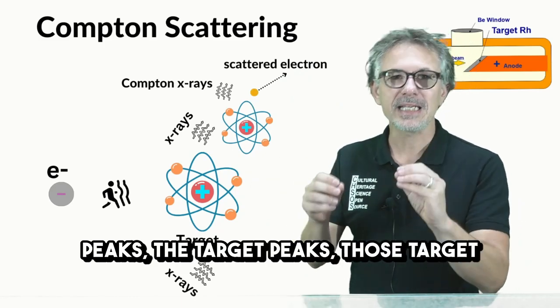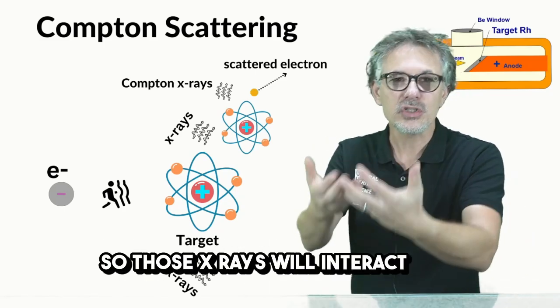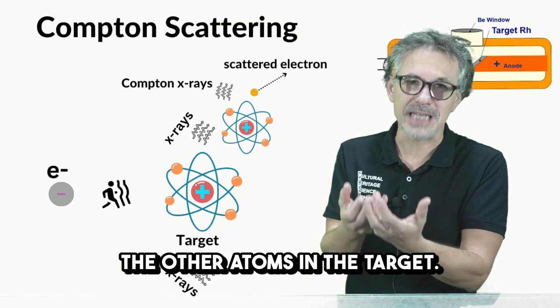Those target peaks, those X-rays, will interact with the other atoms in the target.